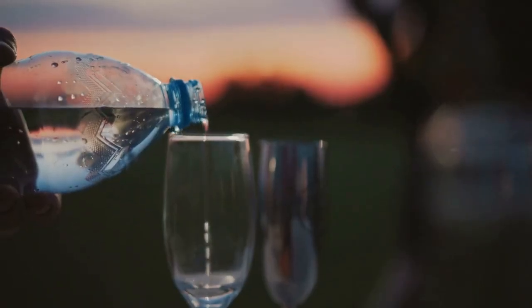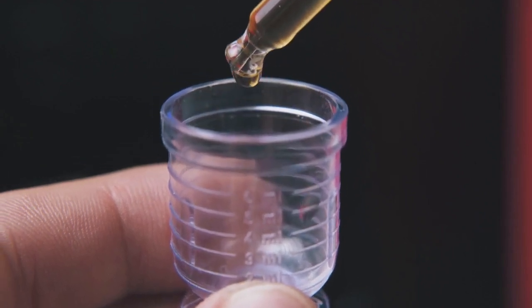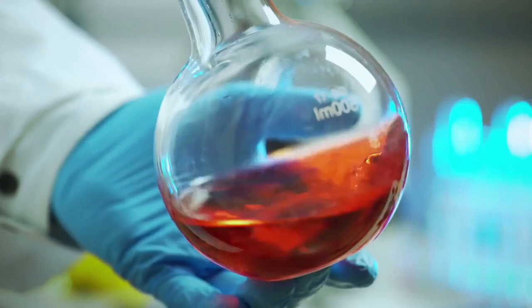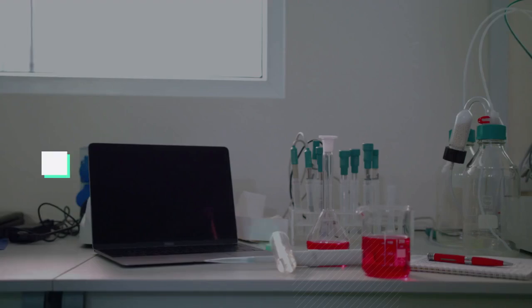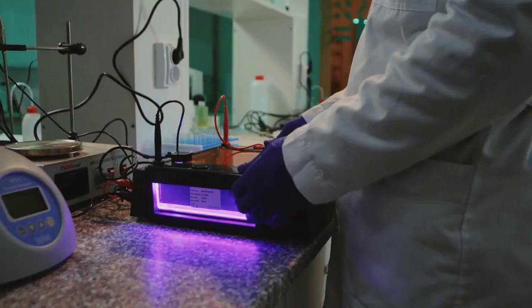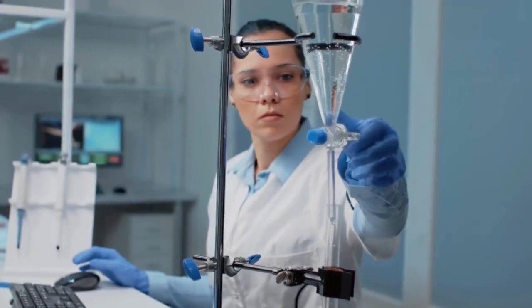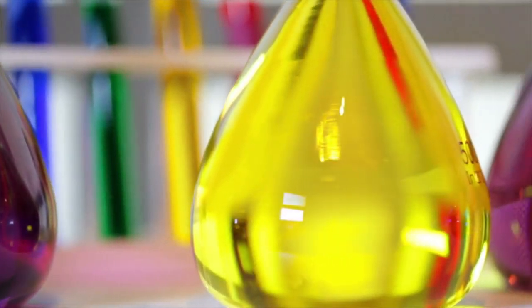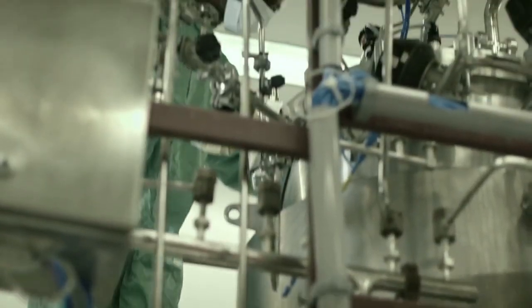Think about shining a flashlight through a glass of juice. The darker and more concentrated the juice, the less light will pass through to the other side. Photometry is the scientific version of this simple observation. The primary instrument used is called a spectrophotometer. This machine has a light source, a component that selects a very specific color or wavelength of light, a special transparent tube called a cuvette to hold our liquid sample, and a detector on the other side to measure the light that successfully passes through.